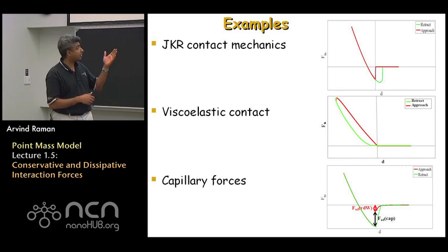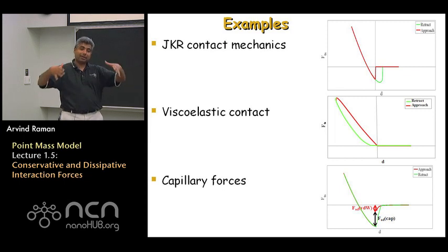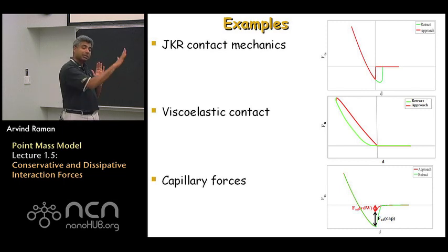And that's again shown in the figure, where you see the tip approaches the sample along the red curve following a certain attractive force, but when contact occurs, suddenly a liquid neck forms and the force jumps to a lower value, representing the additional force applied by the capillary as it suddenly forms and is pulling the tip into the sample. And then as one goes further into the sample, one follows a Hertz-like law from that point onwards.